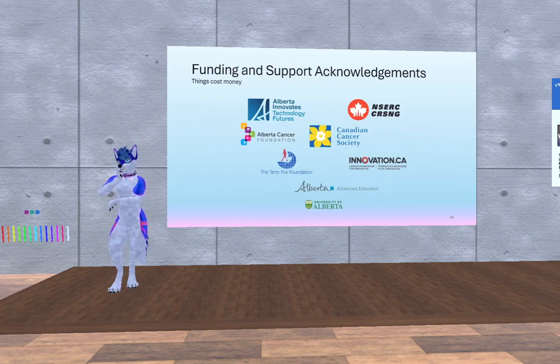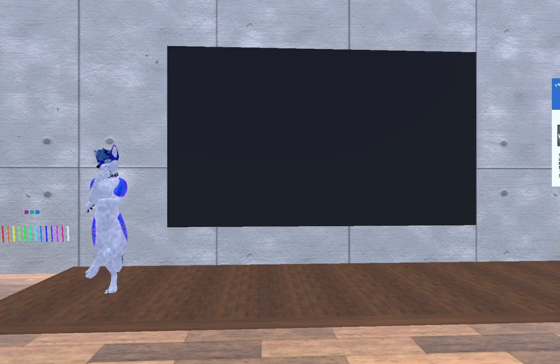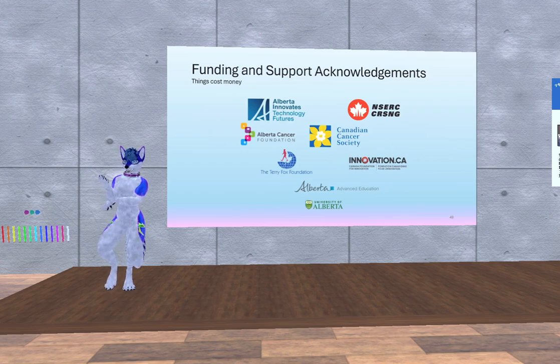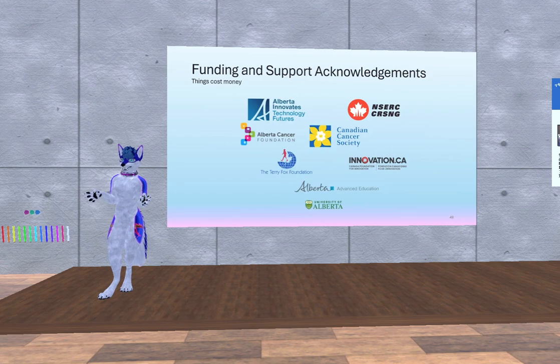So I think the whole aspect of image quality characterization is a trap. It's a trap of the subject because it really matters what you're looking at, what information you're trying to get at. Something that is useful for machine vision is not necessarily pretty to look at for a person. A good example of this is, imagine an image that's just a black field and a single white pixel. You have essentially infinite SNR, but it's not very helpful. What you really want is some combination of low noise relative to what you're looking at, because you want some kind of clarity, but you also want good enough contrast. It doesn't do you enough good to be able to see one thing, but not see one thing relative to another, which is usually what you care about, right?